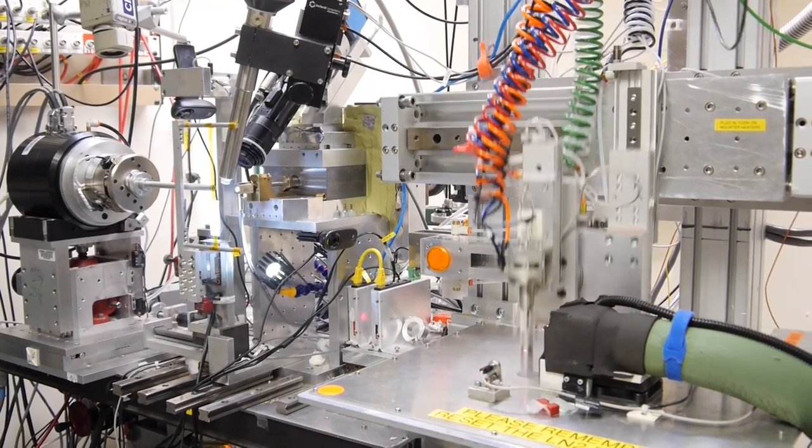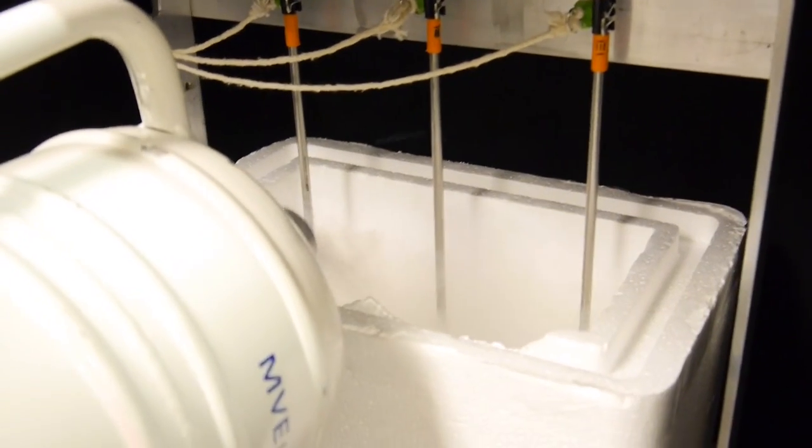Cryo-freezing under pressure has two kinds of benefits. One is it lets you get x-ray diffraction data of higher quality than you can with normal cryo-freezing. So that's sort of a means to an end, the end being trying to determine the structure of the protein.